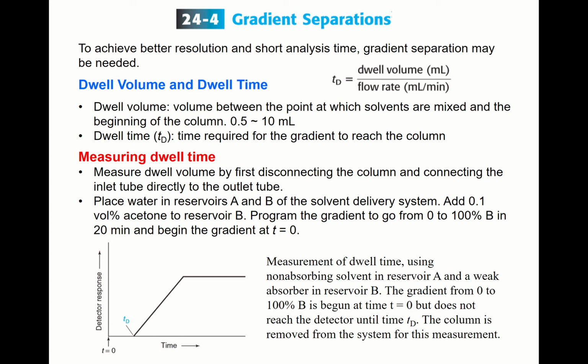So likewise, but in LC, usually temperature programming is not done. Rather, LC is operated at constant temperature. Sometimes the temperature may be higher than 50 degrees C, but usually a little bit lower than that.